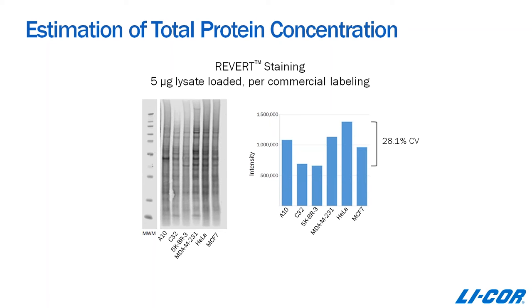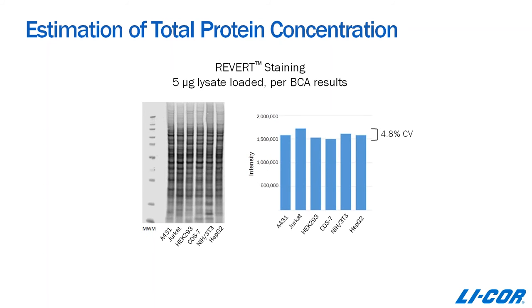So what happens if we actually do a protein assay on those lysates? To minimize error, you really have to take this step and adjust for sample concentrations to make loading as consistent as possible. We used the BCA assay to determine the protein concentration of each sample, then repeated the experiment by loading five micrograms of lysate based on BCA results, transferred to a membrane, stained with total protein stain, and measured signal intensity. The CVs were dramatically reduced, with much more uniform loading. The sole purpose is to minimize error and allow much more accurate sample-to-sample comparisons.